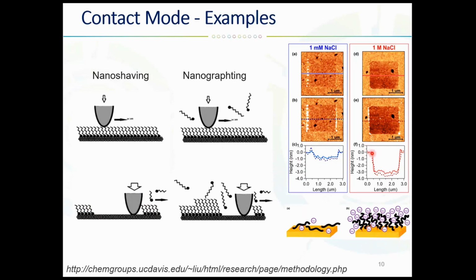So that's why we have a larger shift in height, because when we scratch all the sequences from here, the difference, as you can see, is about 1 nanometer, 1.5 nanometer, this is the thickness of DNA. But if these DNA stand still, then you can see much higher shift in the height here, because these strands are perpendicular.